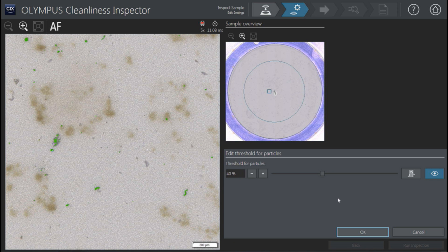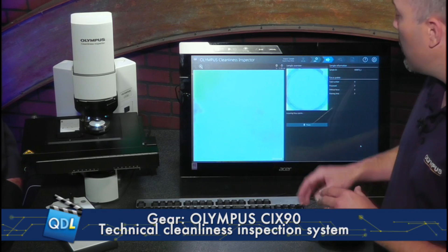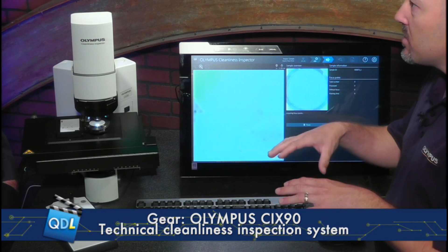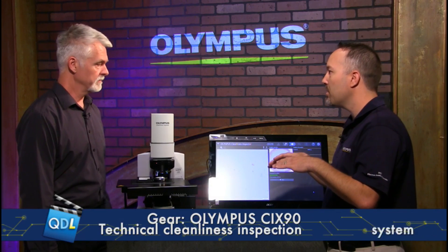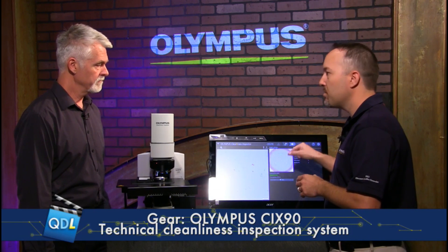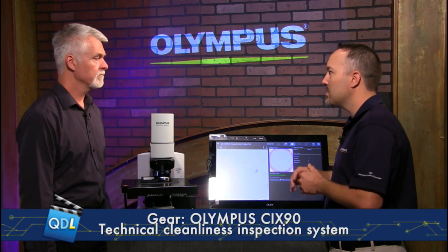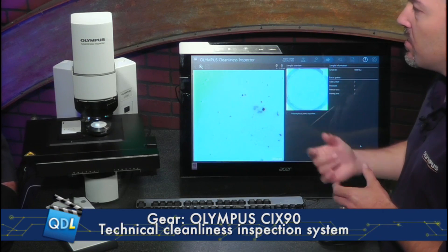The other couple of steps are to set the scan paths. If they need to adjust the scan path, that's what the overview image in the middle is for. If their flow-through area shifted a little bit, they can adjust that down here. Once they make all these adjustments, they just hit run inspection. Now it goes through and captures a few focus points on the surface of the filter — this corrects for tilt and can correct for waviness of the filter paper, because sometimes they get dried and kind of potato chip. The system does this fully automated, going through and autofocusing at multiple points, creating a topographical map as it does the scan.